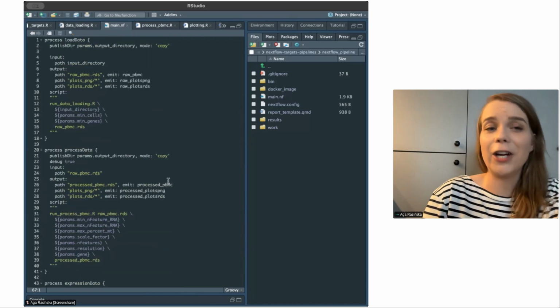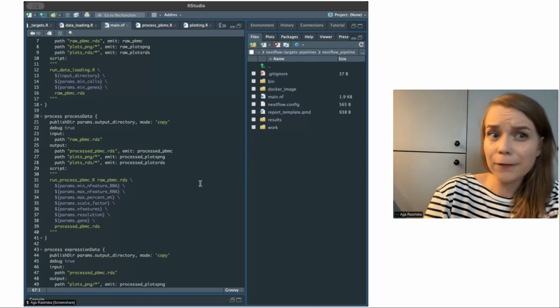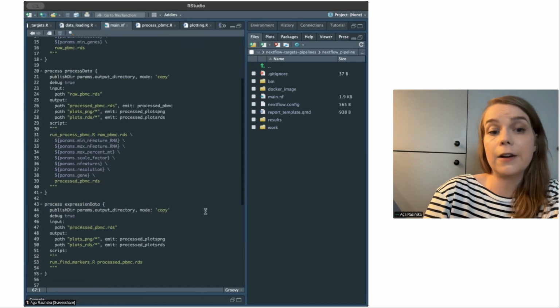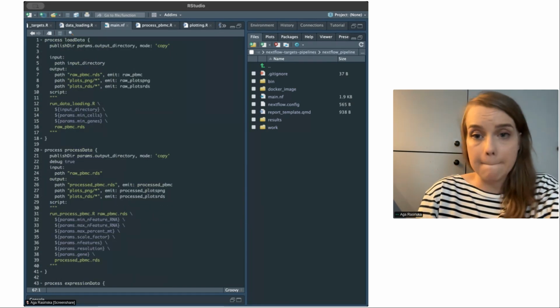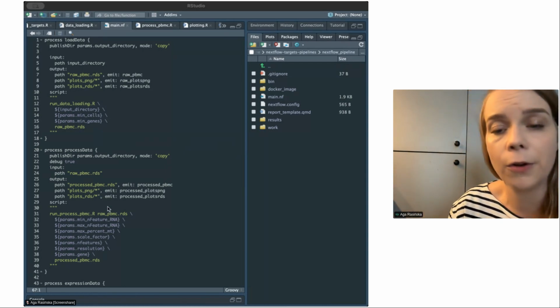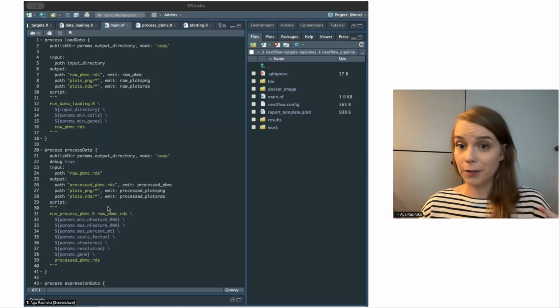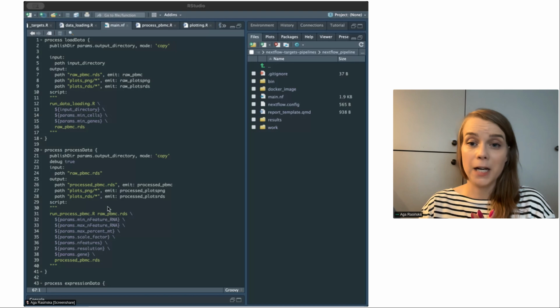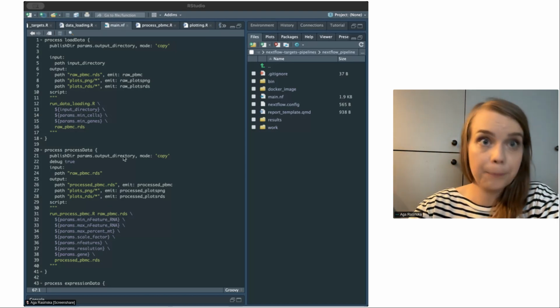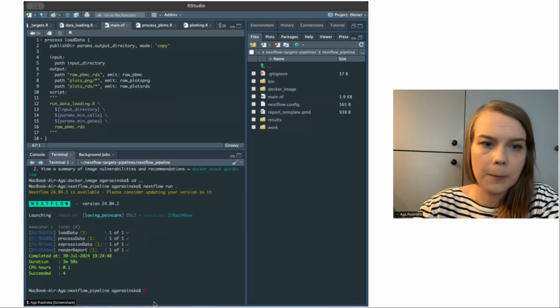Easy as that in terms of Nextflow. In this case, I'm using only R script, as all my analytics are in R, as I'm using Seurat. But if I would like to expand my workflow, my pipeline, I could also define some processes in Python, or even add some tools before, after, and expand the workflow that I'm looking for. So let's see how the pipeline is going.